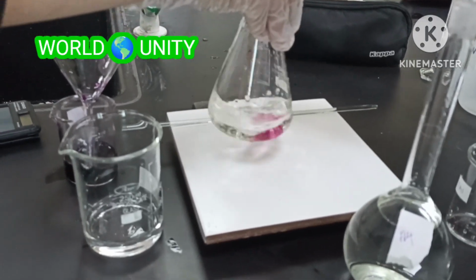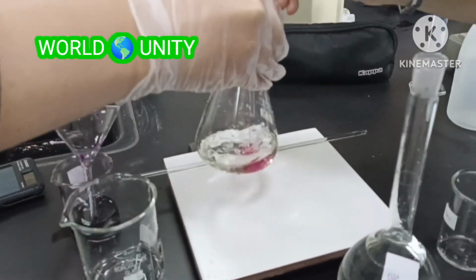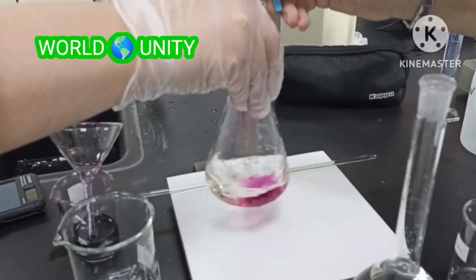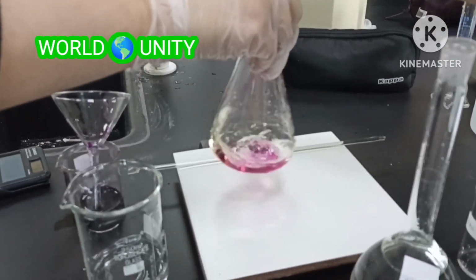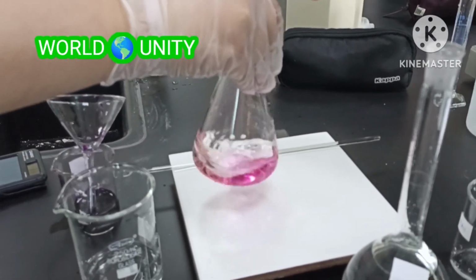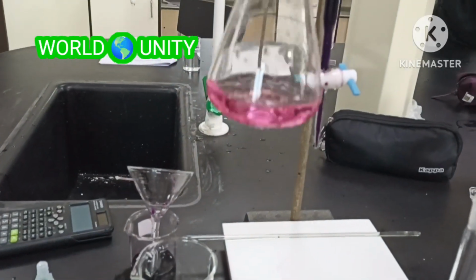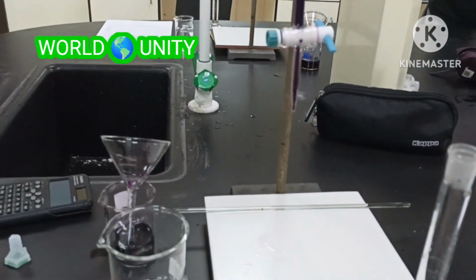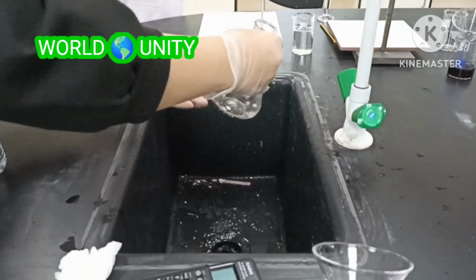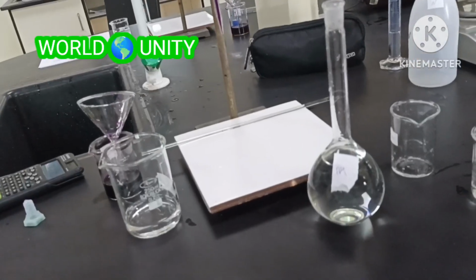When you see it pale pink, please stop. More. Oops. Yay, yes, you get the result. Guys, this swirl, so pretty. So where is your reading? This is 12.8. And then? And now, what's next?